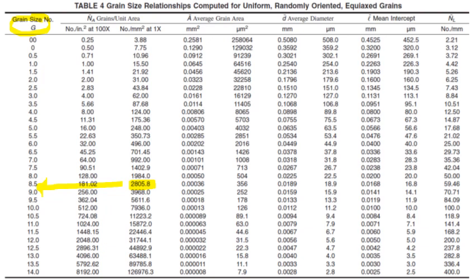And then to identify the closest mean intercept, we look over here, column 9 for mean intercept, and the closest mean intercept we get is around 16.8, a hair lower, because our value for grains per unit area was a little bit higher than the value in column 3.